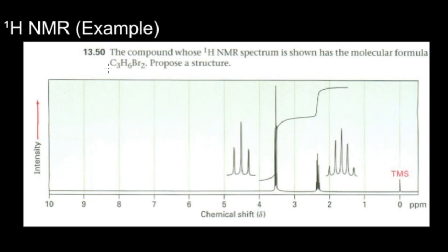Here is another example to apply the knowledge that we've learned to a real problem. Given the composition of one compound, you would like to know its structure using the NMR spectrum. You are given the following data. You have 2 peaks, which correspond to 2 types of hydrogen atoms, and you can see from the N+1 rule that this one is split into 3, which means it has 2 atoms nearby. Whereas here, it has 5 peaks, which means it has 4 atoms nearby.